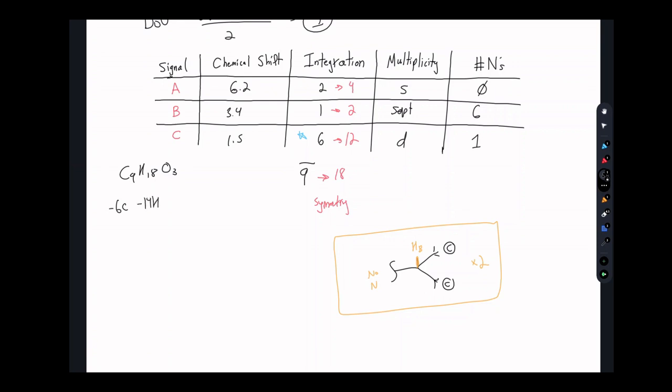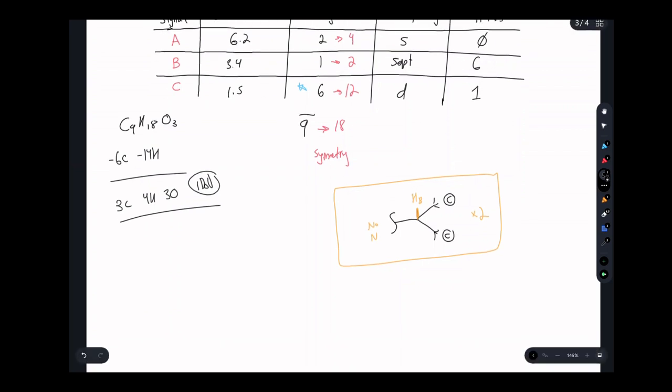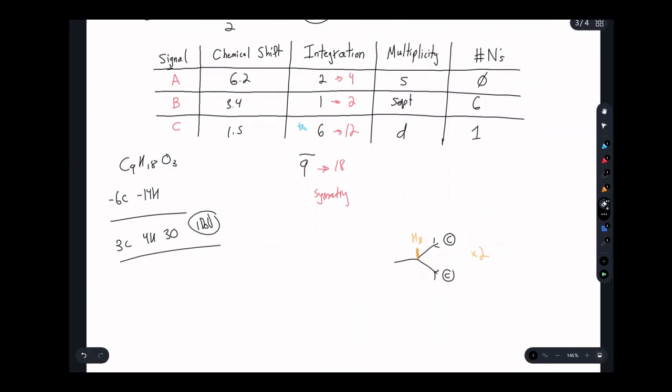And we haven't dealt with any oxygens yet, meaning we have 3 carbons, 4 hydrogens, and 3 oxygens left to deal with. Don't forget, we still have that DOU as well. So let's make an assumption. Let's take our fragment here, and based on that chemical shift, see what happens if we try to put oxygens there. At this point, I'll start drawing the other side of this molecule.